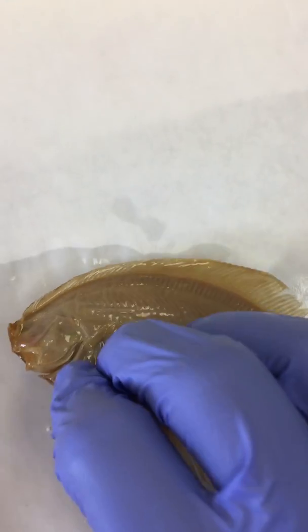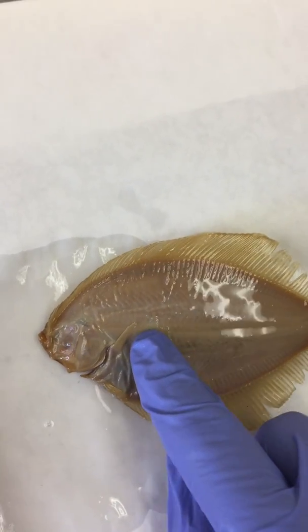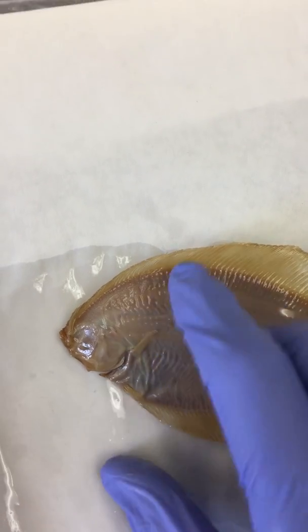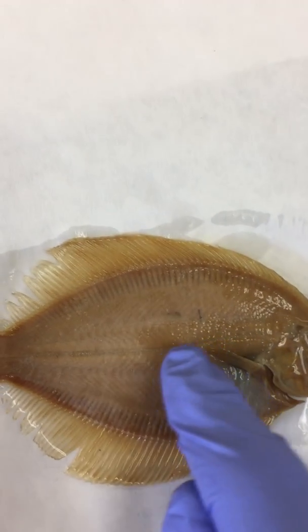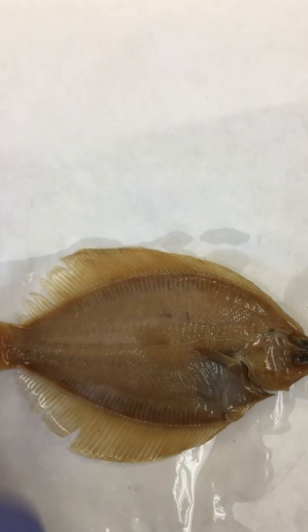If we look on the other side, we'll see we also have the pelvic fin down here and the pectoral fin here. We also have a nice lateral line running along the length of the fish, detecting the movement of nearby fish or water movement above it.